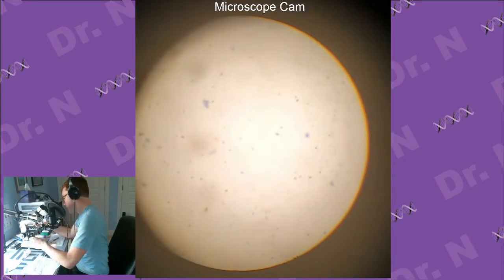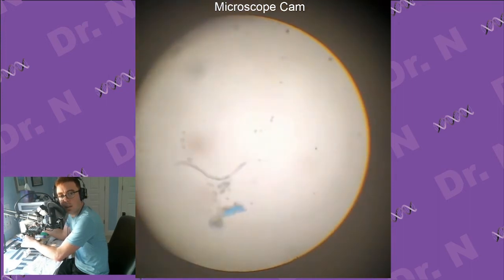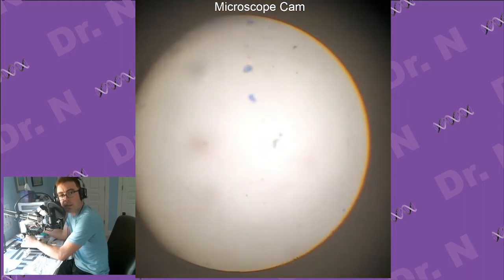Scope camera. Let's move around and find some of those, see what they look like at a lower magnification. So all the blue bits are kind of dyed or stained pieces of fly larvae.